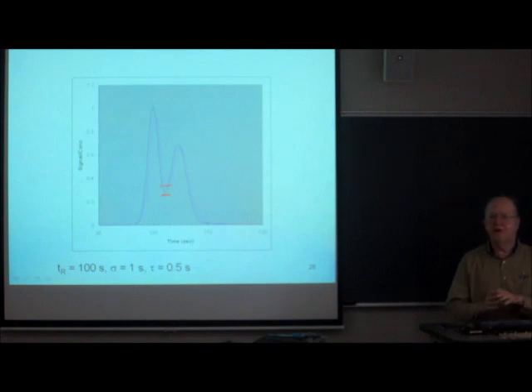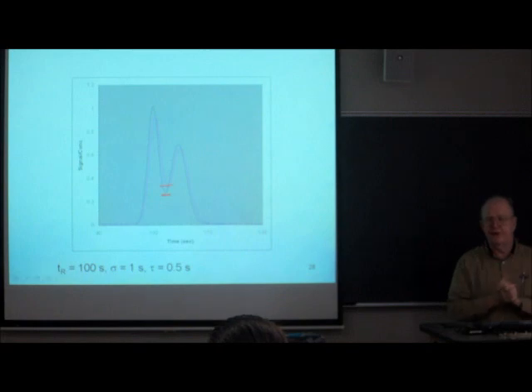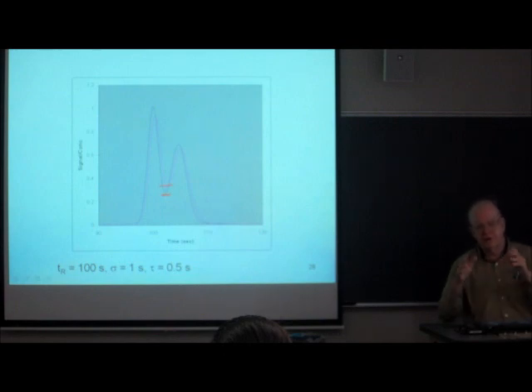The same sort of thing would happen with using injector volume. If you had two peaks that were close together and you inject too much volume, you can diminish the resolution, the valley, between the two peaks that are separated. You want to increase the volume to get more signal, but you increase it too far and you screw up the resolution.